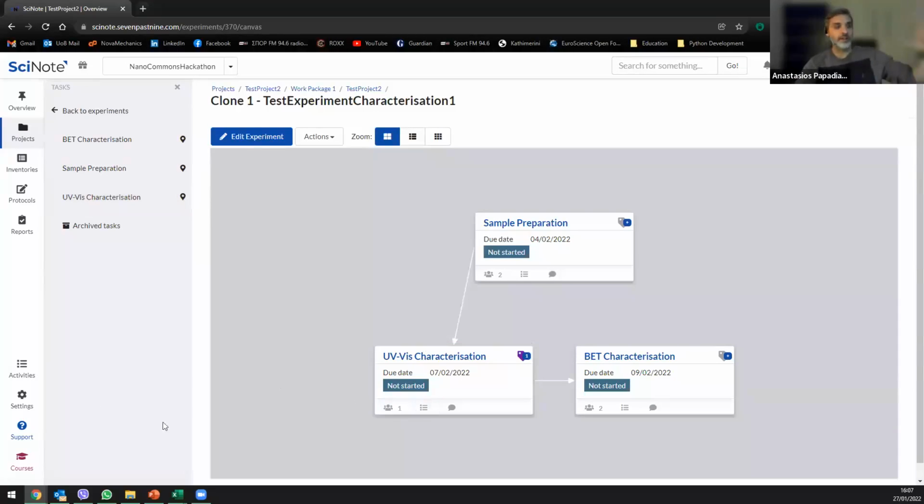In this case, you will not have this step-by-step format, but you will have a Word file of the protocol. It would be best, in my opinion, to spend a substantial amount of time to import your protocol into a step-by-step function, because you will see there are some benefits to that.